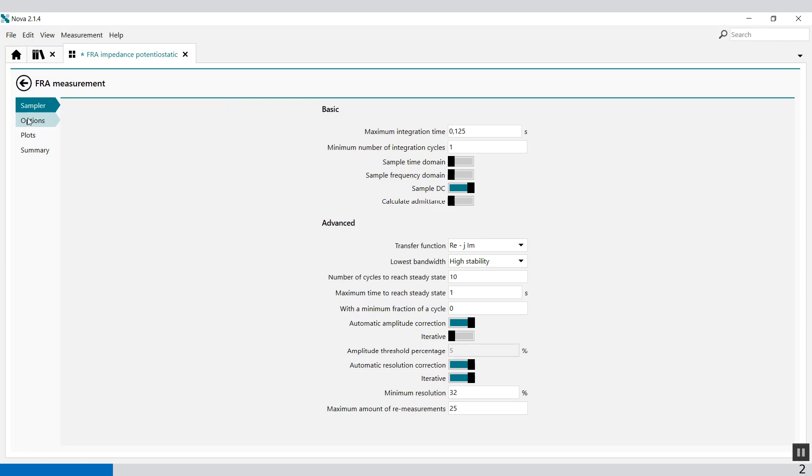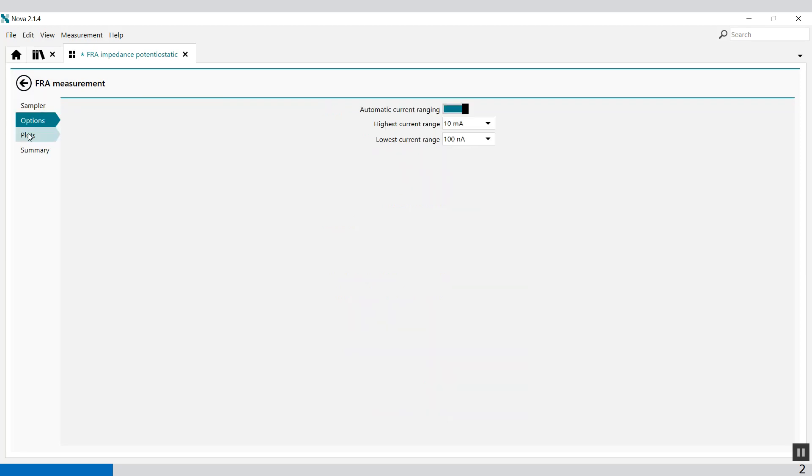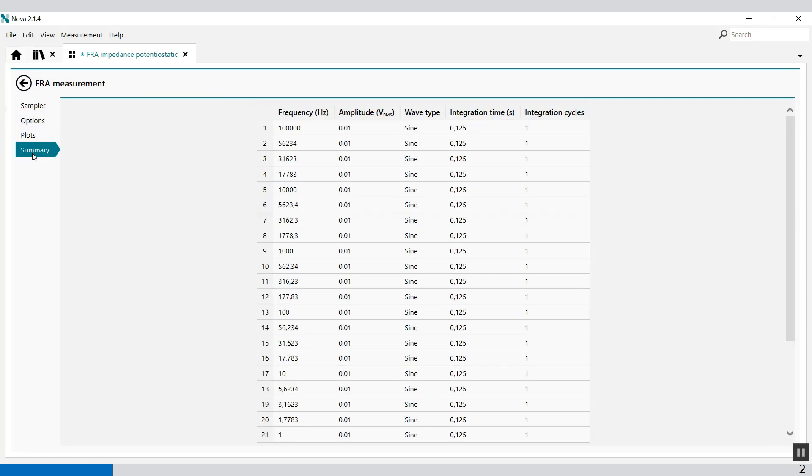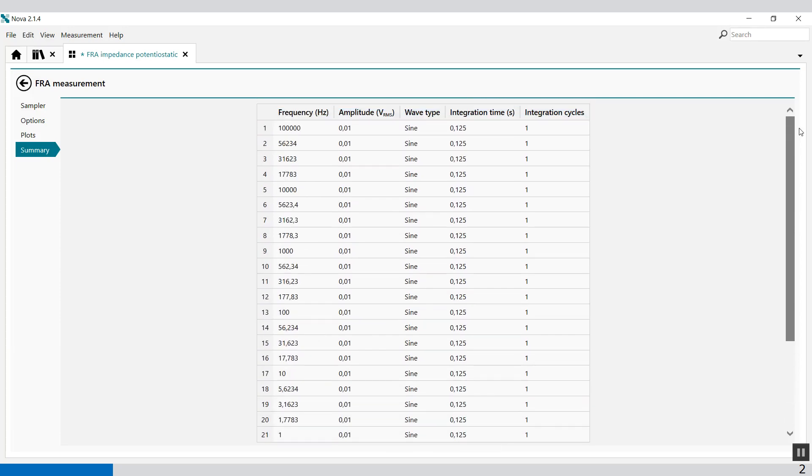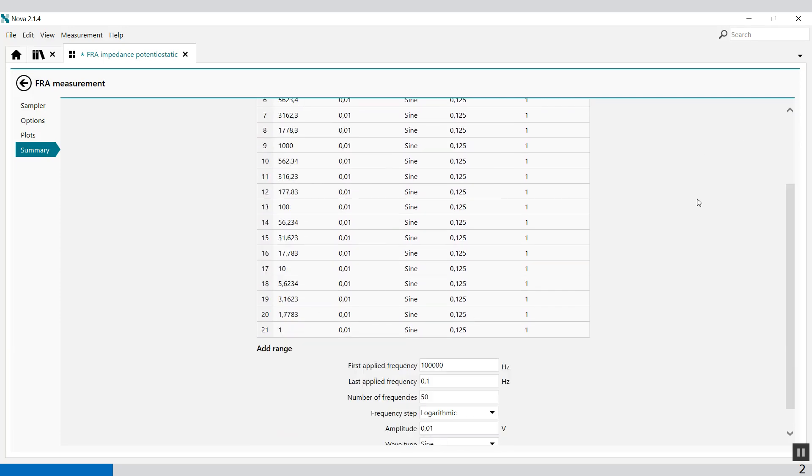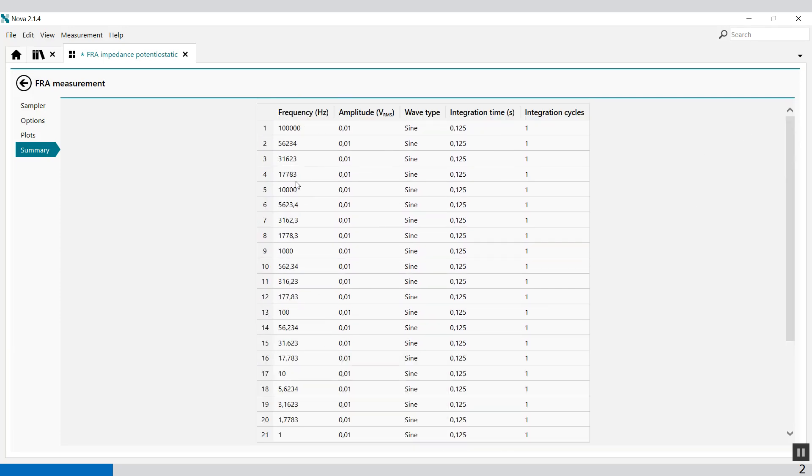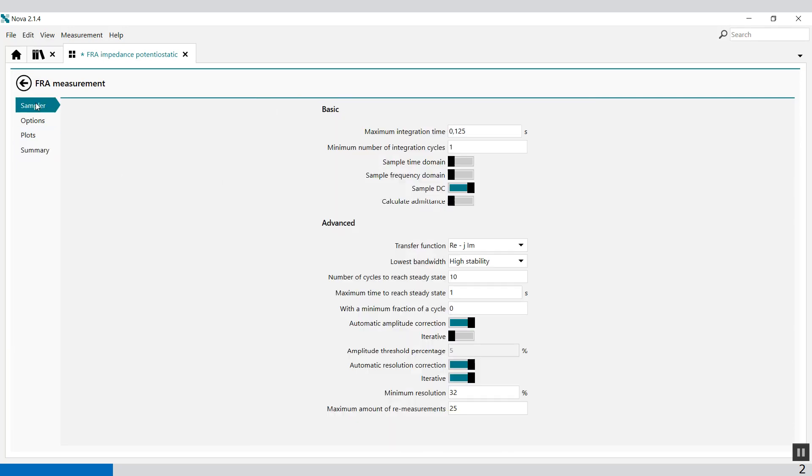You will find the Sampler, Options, Plots, and Summary. In the Summary you will see how the frequencies are distributed. In the Sampler there are some basic functionality and some advanced functionality.